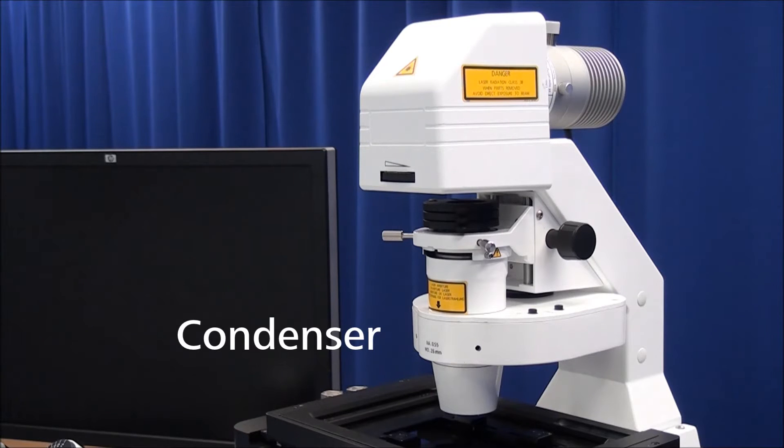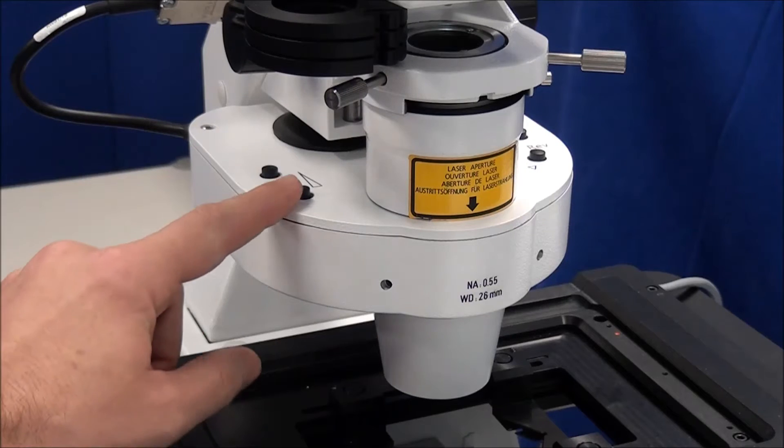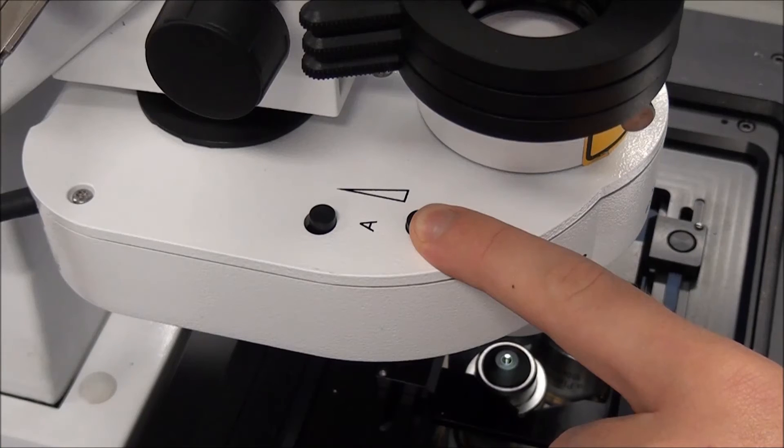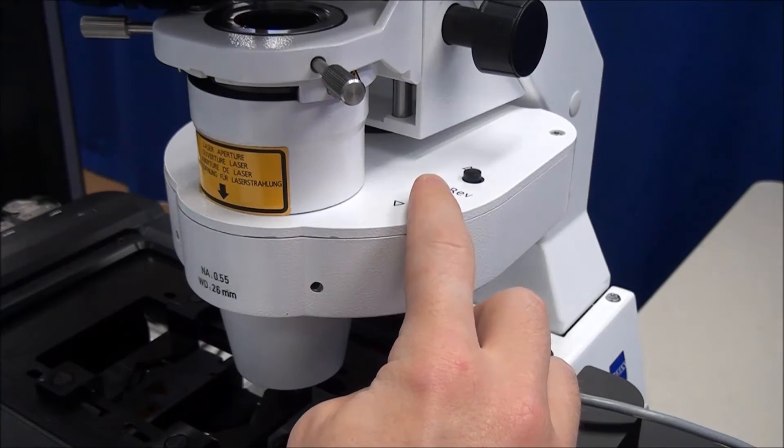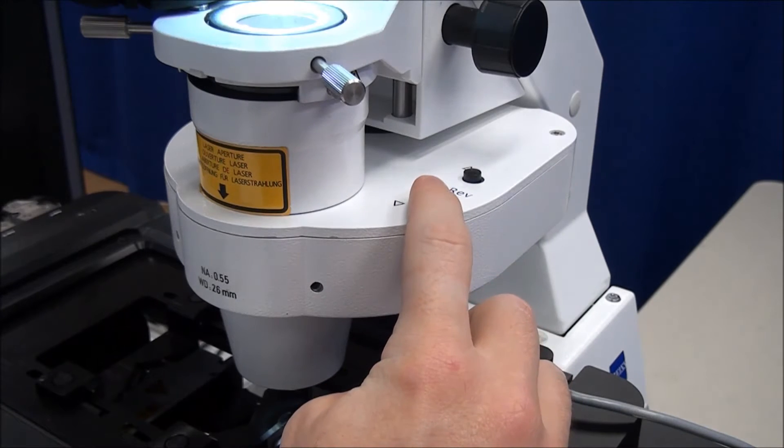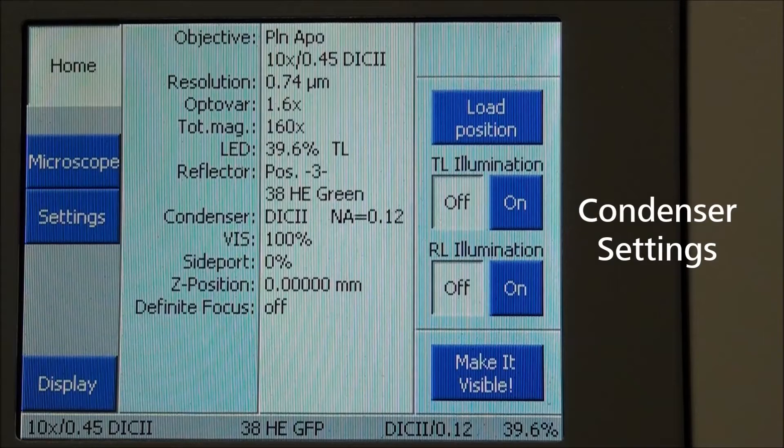Open the aperture diaphragm located on the condenser to its widest open position. If the condenser allows for multiple contrast methods, set the current method to H for bright field. Sometimes this is labeled BF.